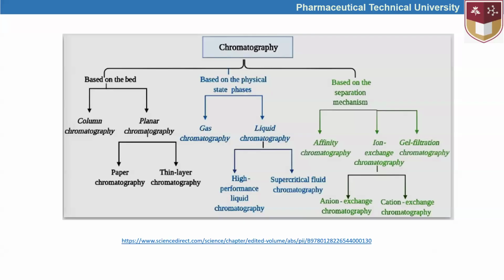One type of affinity is the affinity between agarose and lectin. Lectin, a protein of plant origin, is tightly linked to agarose. That is one of the well-known examples for affinity chromatography.